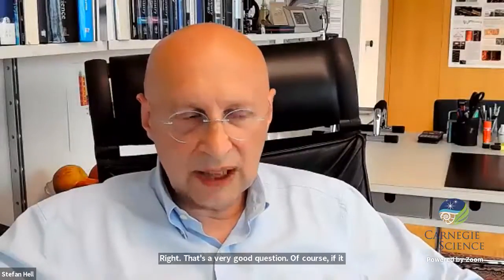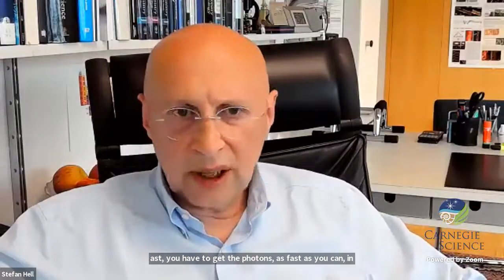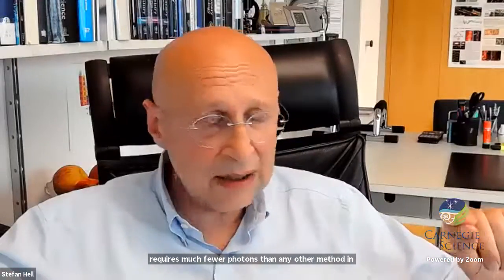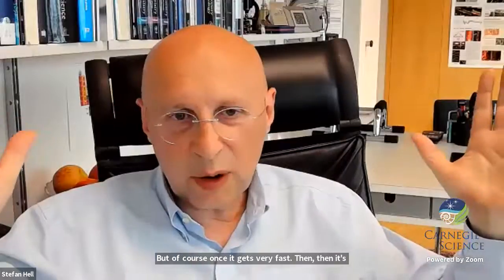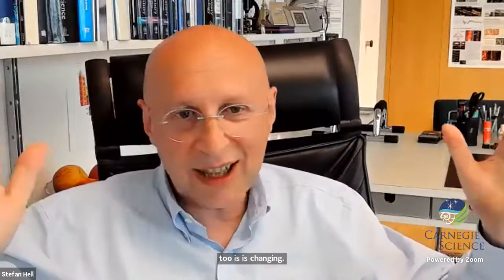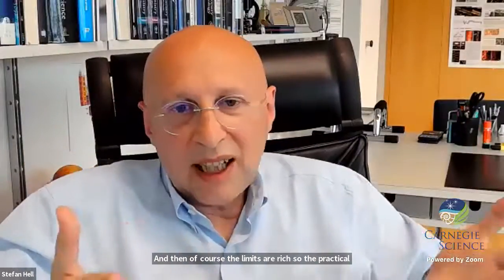Niels asks if you could explain more about how you image a molecule or a cellular structure that isn't staying in one place. That's a very good question. Of course, if it's not staying in place, you have to be fast. You have to get the photons as fast as you can in order to locate it. The good thing about the MINFLUX concept is that it requires much fewer photons than any other method to find out where the molecule is. So we can be faster, as I explained, by a factor of 10 or 100. But once it gets very fast, it's not possible to see the structure anymore because the structure is changing, and then the limits are reached. So the practical limits are given by the fast movements of the molecules. But then you study the movements.